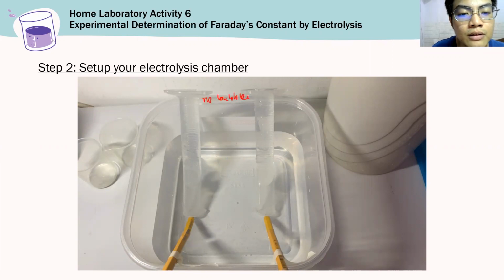Double check that there are no bubbles. And again, you have to ensure that the tip of the pencil is pointing inside your graduated cylinder or test tube.